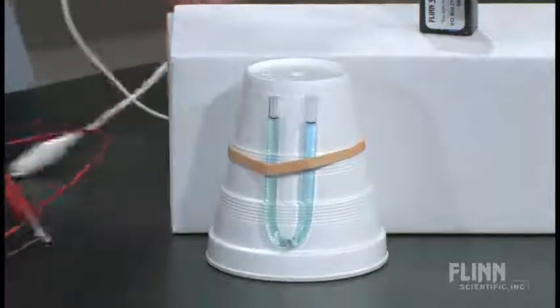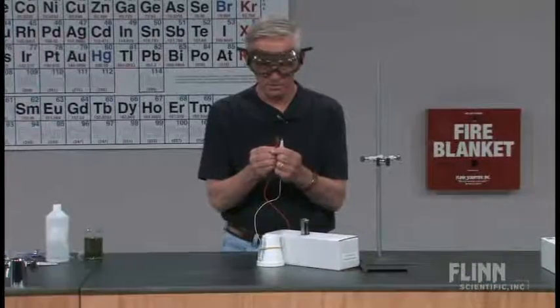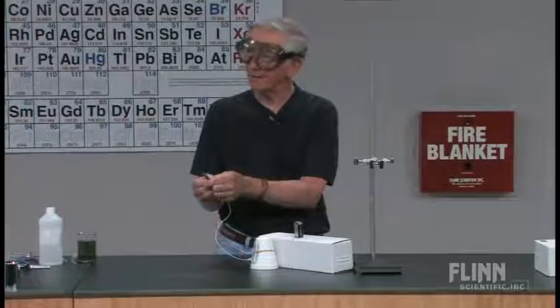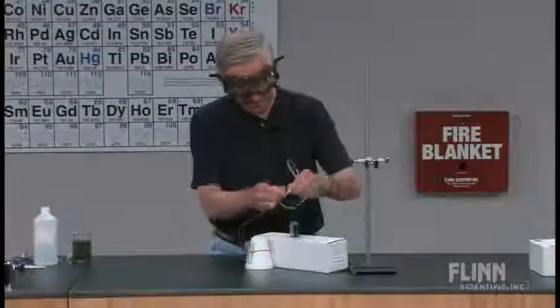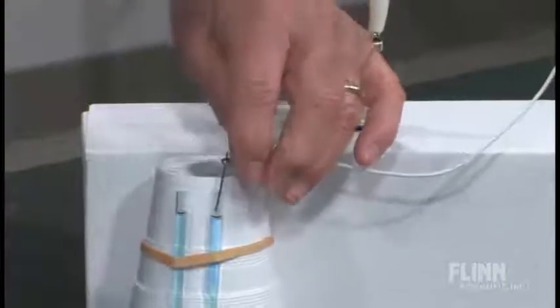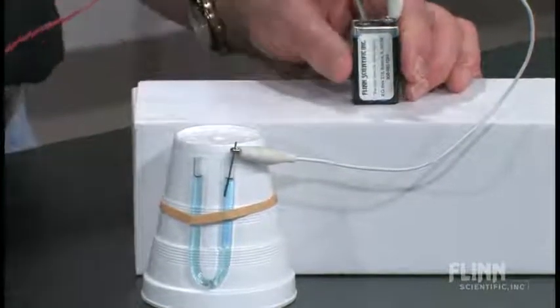For my electrodes, being sort of ever the frugal one, I do, after all, teach at a private school, I didn't want to waste a whole electrode, a whole pencil lead for each side. So I took one and I broke it in half. One pencil lead per student, plenty. One on one side. How far down does it have to be? It has to be in the solution. One on the other side.